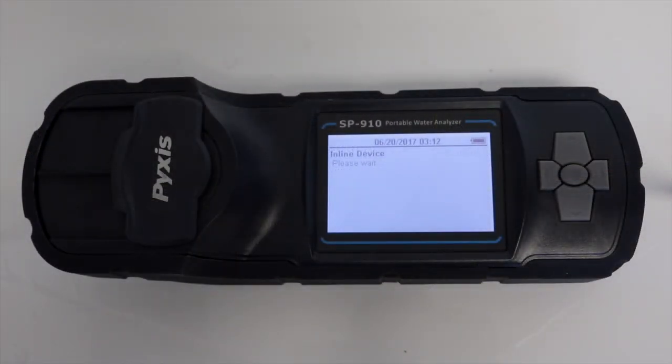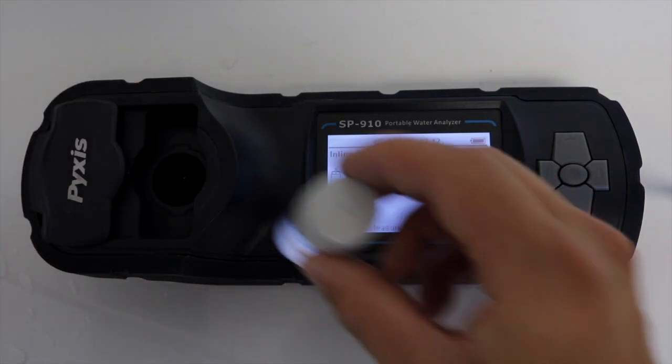Select the corresponding device listed on the SP910. Slide open the shield and insert the system sample that was collected earlier.